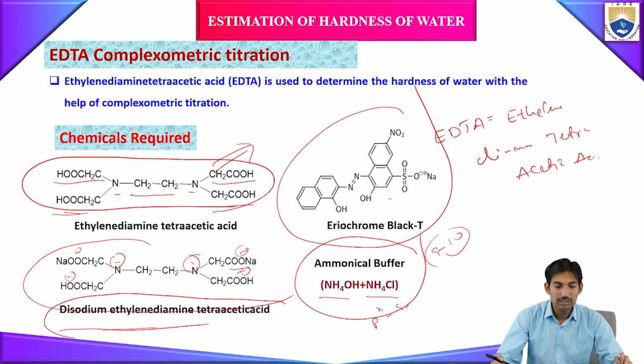Okay, this is the EDTA complexometric titration. These are the chemicals required in this EDTA complexometric titration method.